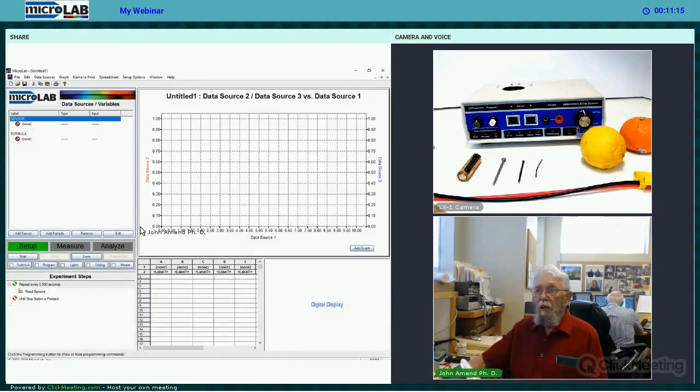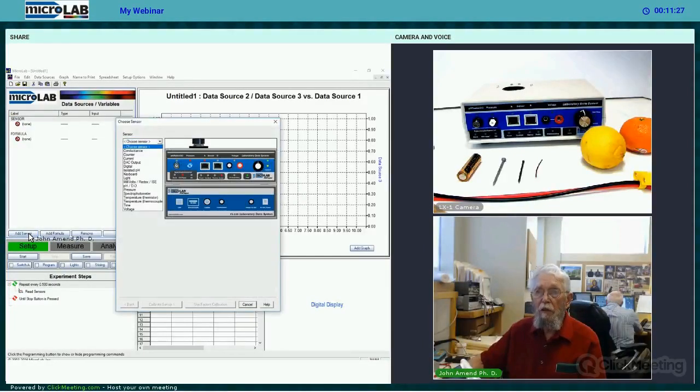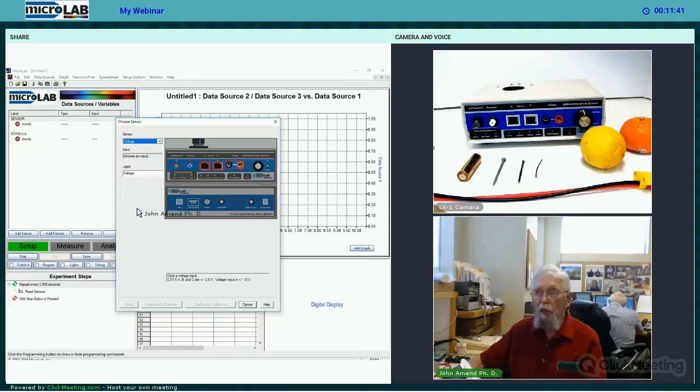And here we go with a screen that comes from that beautiful little machine that you saw before. And we're going to have to try and get things in. We need some sensors. So we have one here in the sensor. And what do we want to measure? We'd like to measure the voltage that would be produced from the cell.